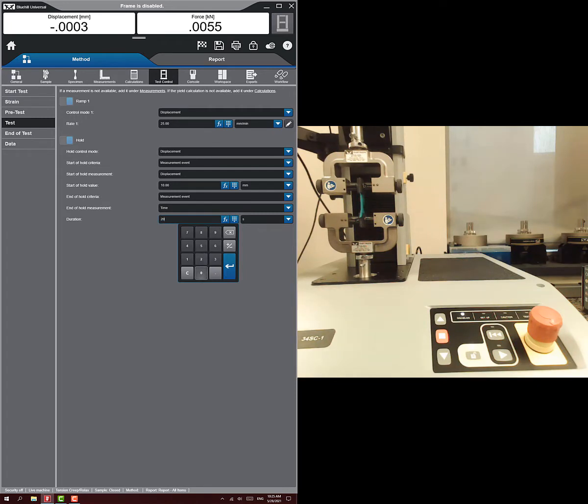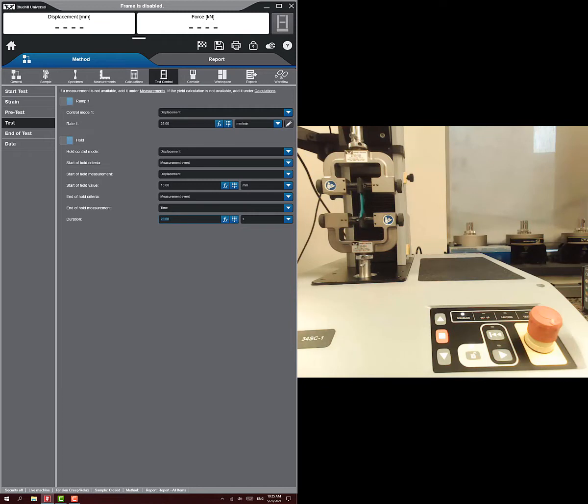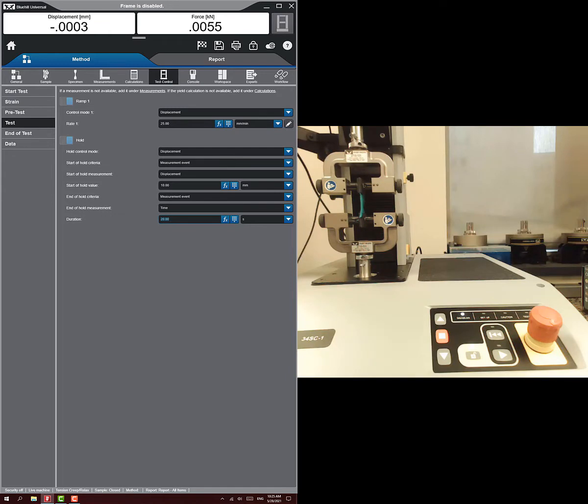You guys definitely want to make that longer when you're testing your tendons. Like probably 60 seconds would be a better value. So what's going to happen, it's going to pull at 25 millimeters per minute. It's going to hold when it hits 10 millimeters, and then it's going to hold for 20 seconds there.